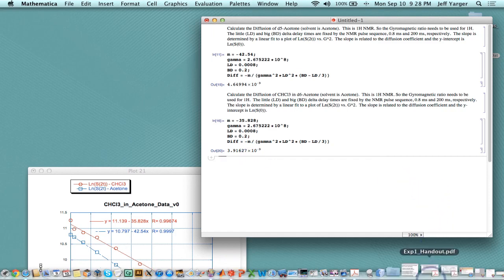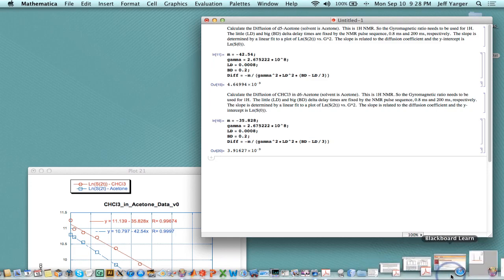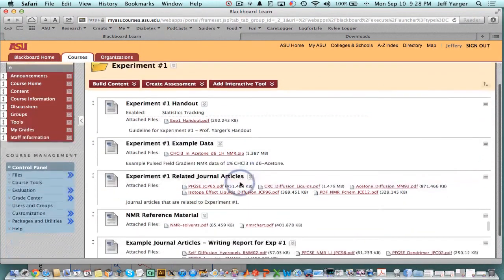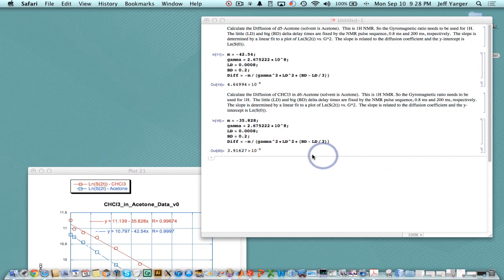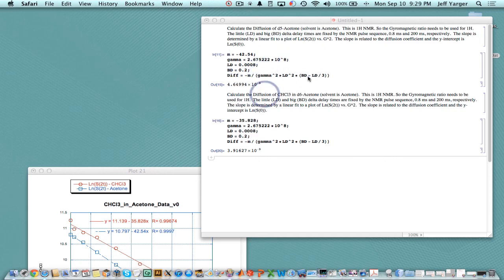I can now compare that to literature values. The CRC Handbook gives 3.6 times 10 to the minus 9 meters squared per second for chloroform, so I'm a little off but fairly close. That's basically a quick overview of how you determine the diffusion coefficient using an internal standard to calibrate the gradient, give you absolute values, and then use that calibrated gradient to determine the diffusion coefficient of a solute. Thanks for listening — I'll see you again soon.